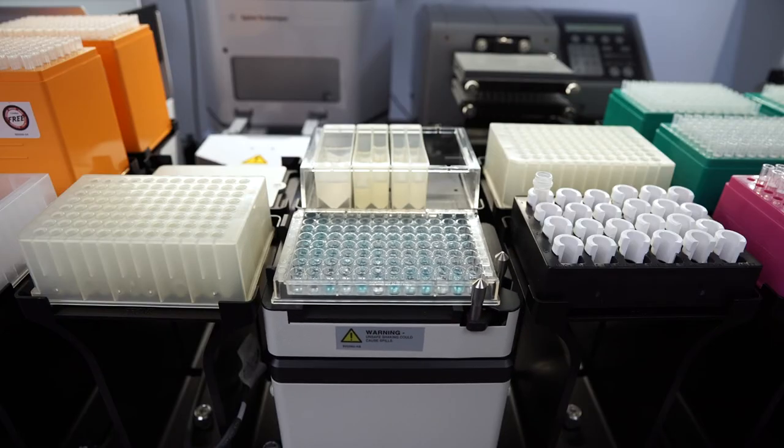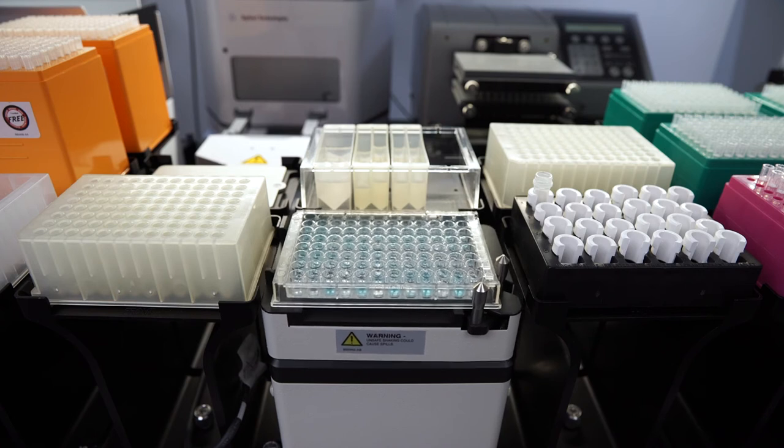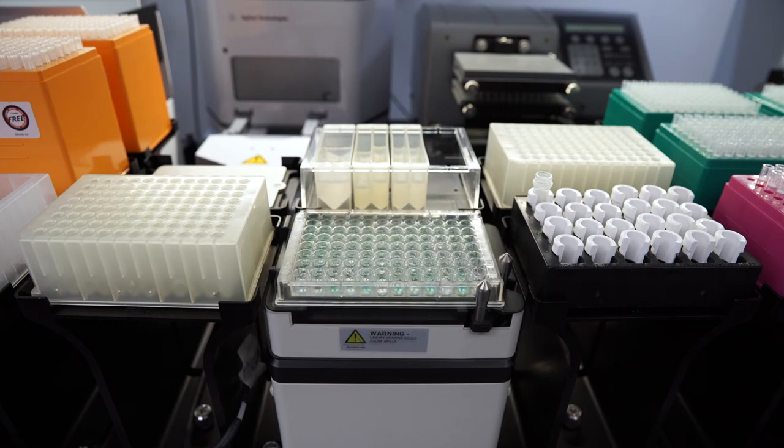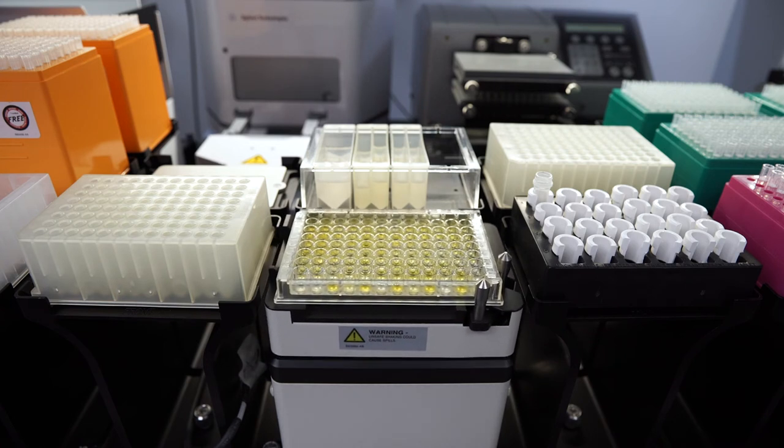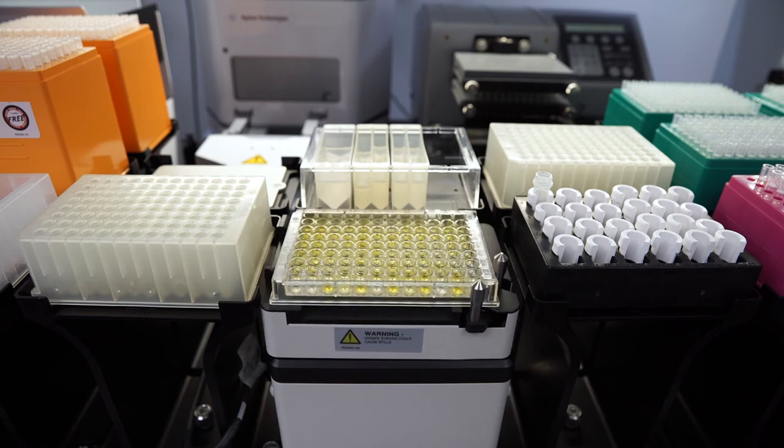Homogeneous mixing of samples and reagents is important to achieve repeatability in ELISA. Orbital shakers on the Biomech provide smooth and continuous mixing without splashing.